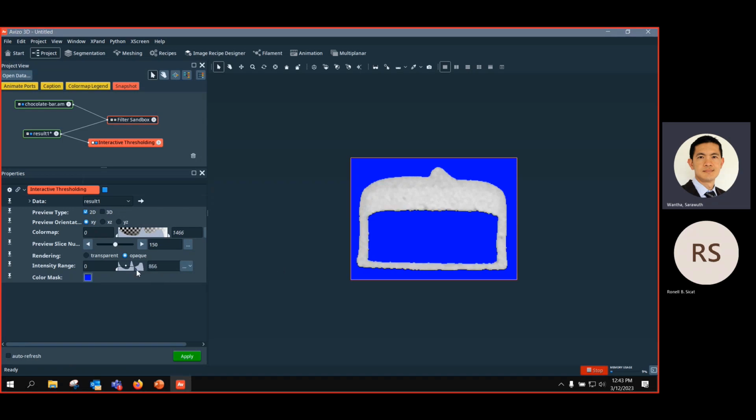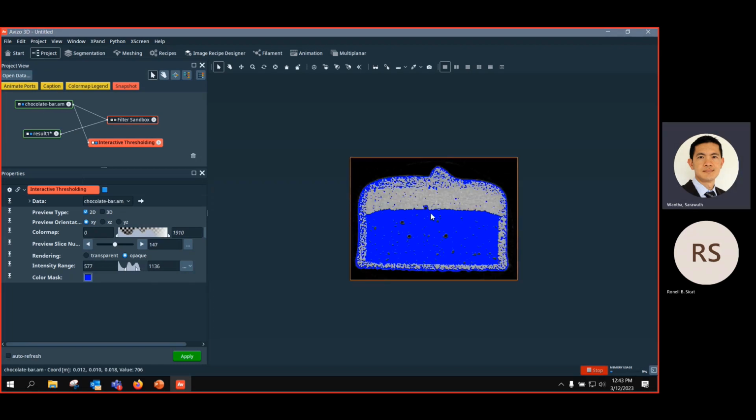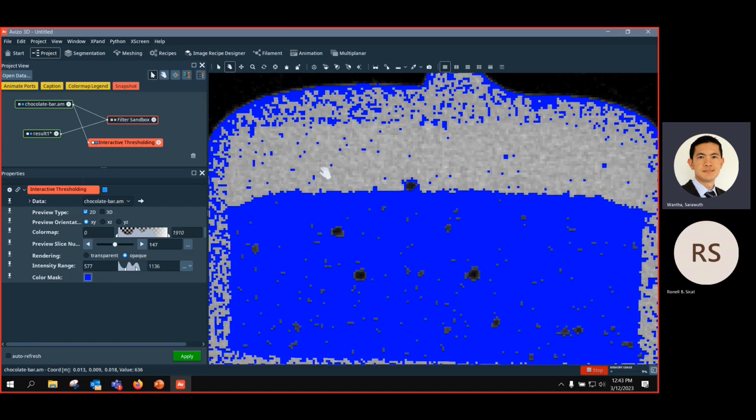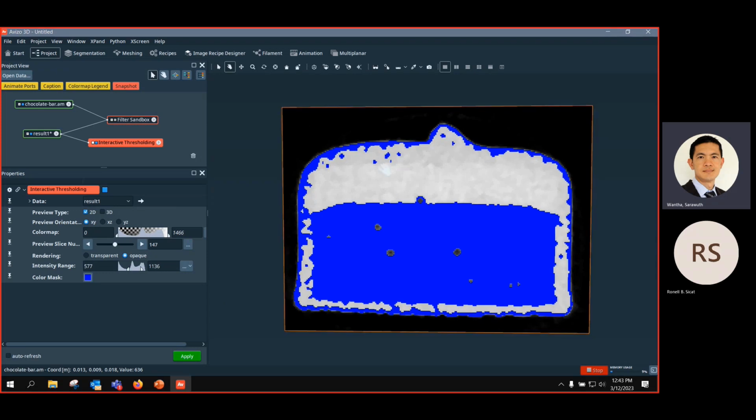And the reason that I do median filter, as you can see here, if I select the higher threshold for the time being quickly, like this maybe, I can move the slider of interactive thresholding to original data. It will look like this. Before median filter, it's really noisy, really pixelated. After you smooth it and use the same module, the same value, you can see most of the noise has been corrected or removed. That's why the filter is a really important step before you do image segmentation.